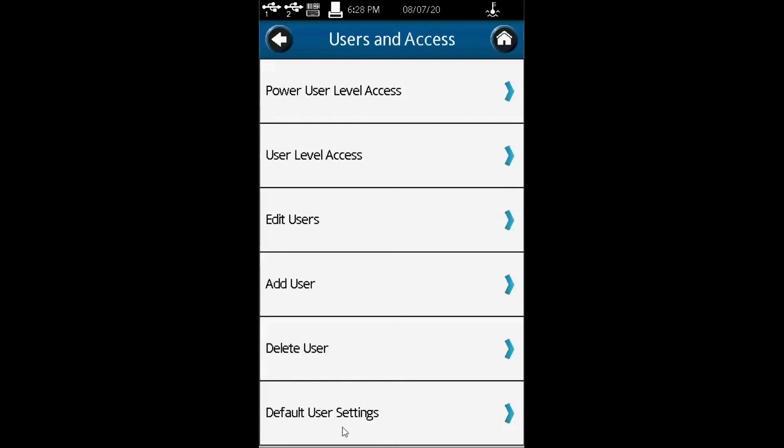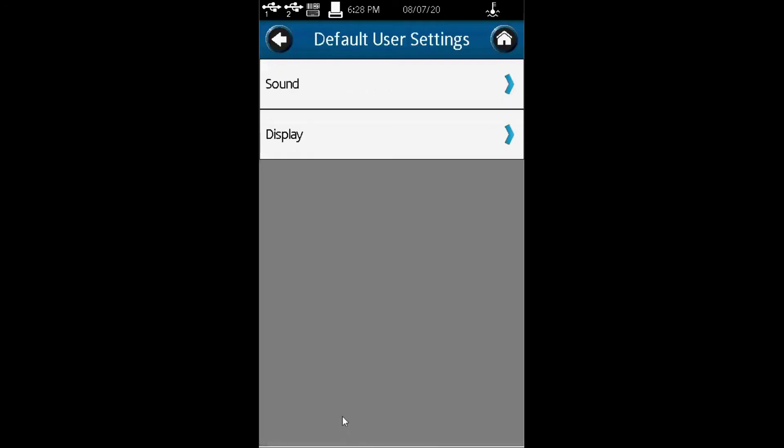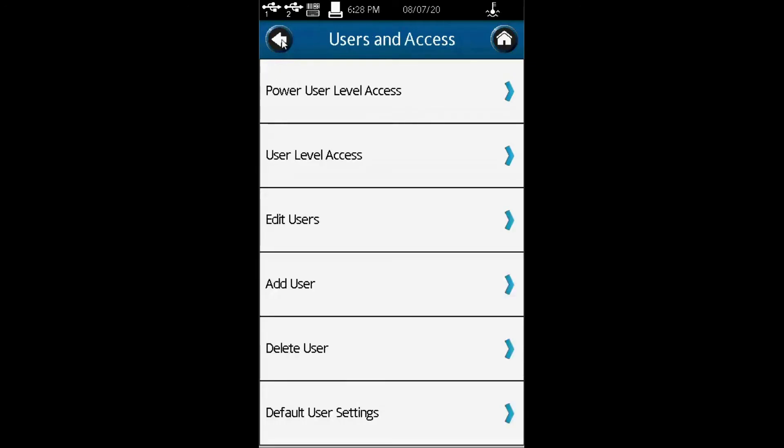You also have default user settings. These are some of the basic functions under 21 CFR compliance that are found in DVNEX in standalone mode.